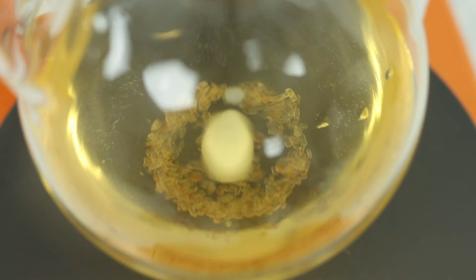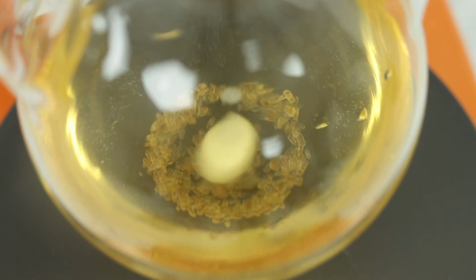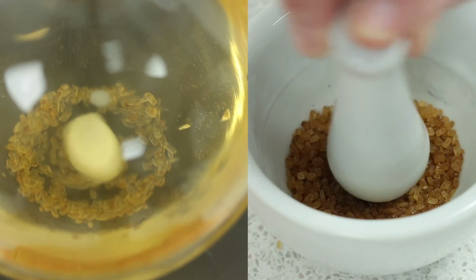are likely to be physically affected by the action of the stirrer bar having a grinding effect onto the particles, reducing particle size, increasing mass transfer, and potentially giving different results to when we need to scale up to an overhead stirred system. Similarly, if there is a crystallization or precipitation stage in the reaction, the differences between magnetic stirring and overhead stirring could lead to issues in technology transfer when scaling up to larger batches.